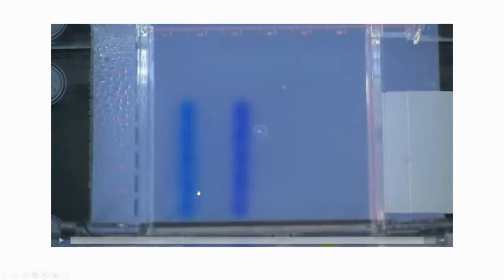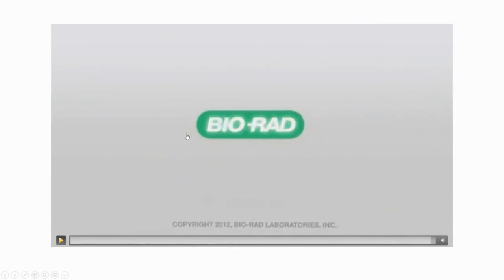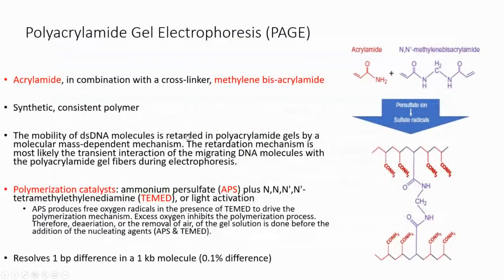Okay. You don't know where your DNA is. All you have is this tracking dye. So this tracking dye helps you to determine when to stop the electrophoresis. Okay, so that's the DNA electrophoresis, and that's for agarose gel.